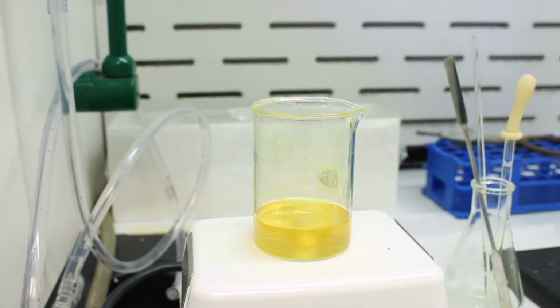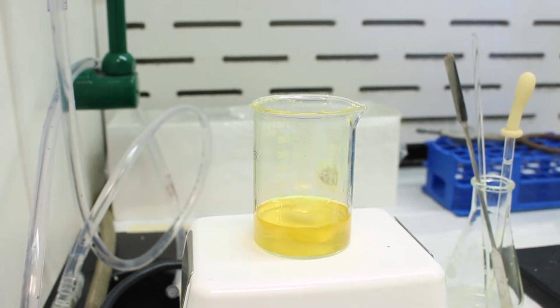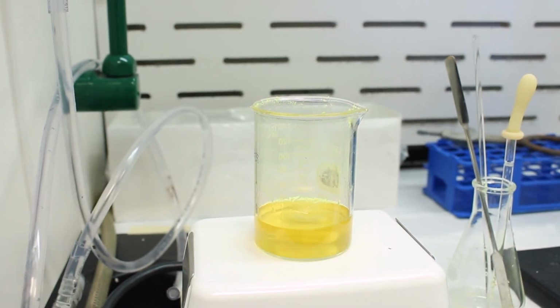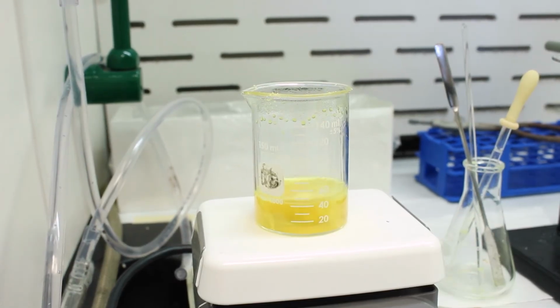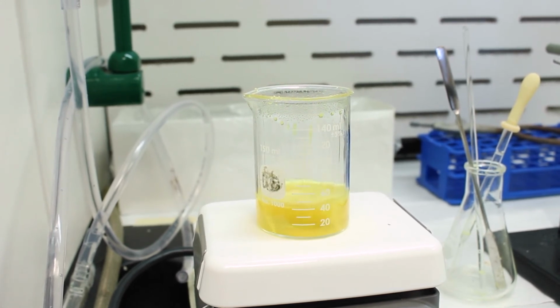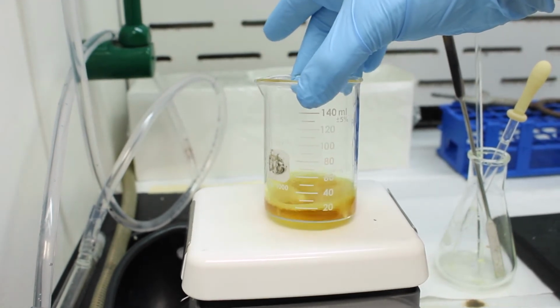Looks like we're going to have to boil it to remove some of the ethanol to make sure we have a good yield. If you put too much recrystallization solvent, when it cools, too much of it will remain in solution and your yield will be low. So we'll boil off some of the ethanol here. All right, so we've boiled off some of the ethanol. I think we're about ready.